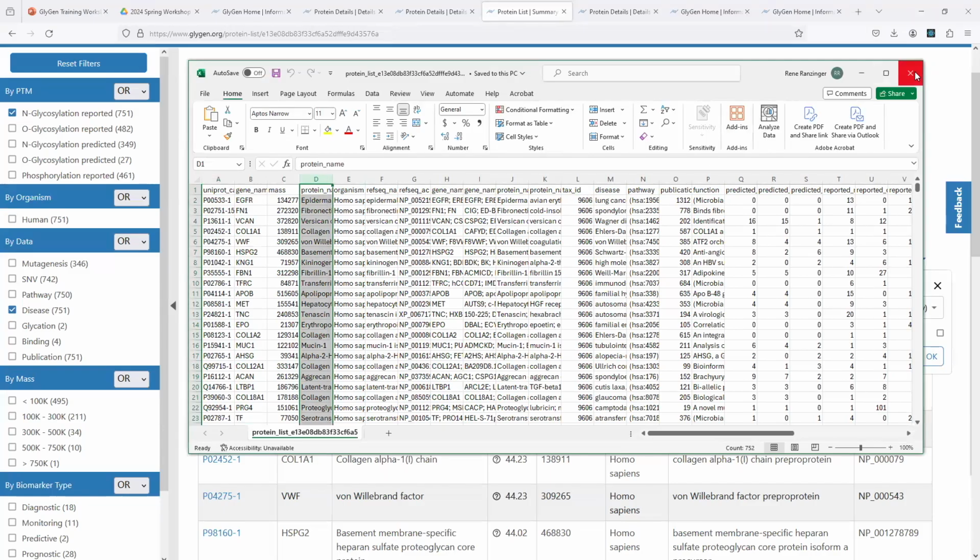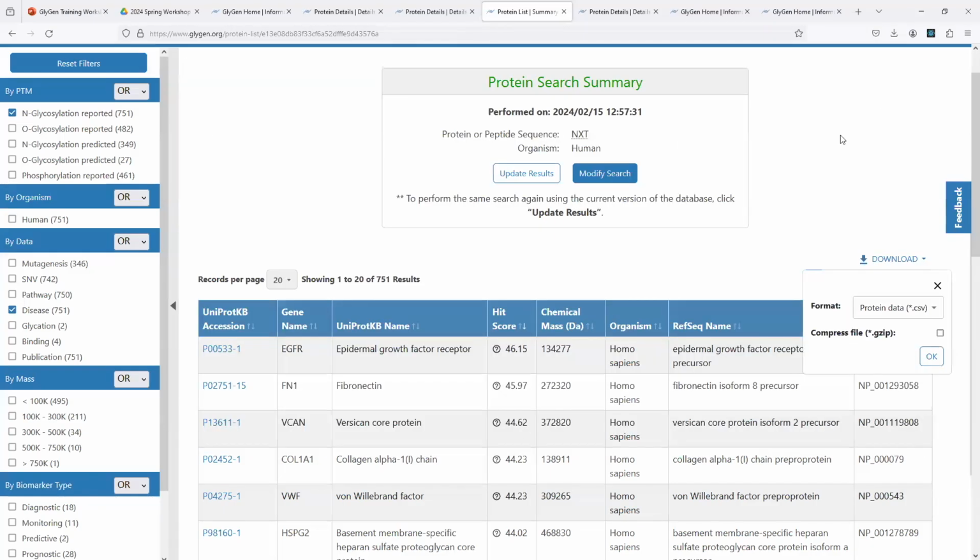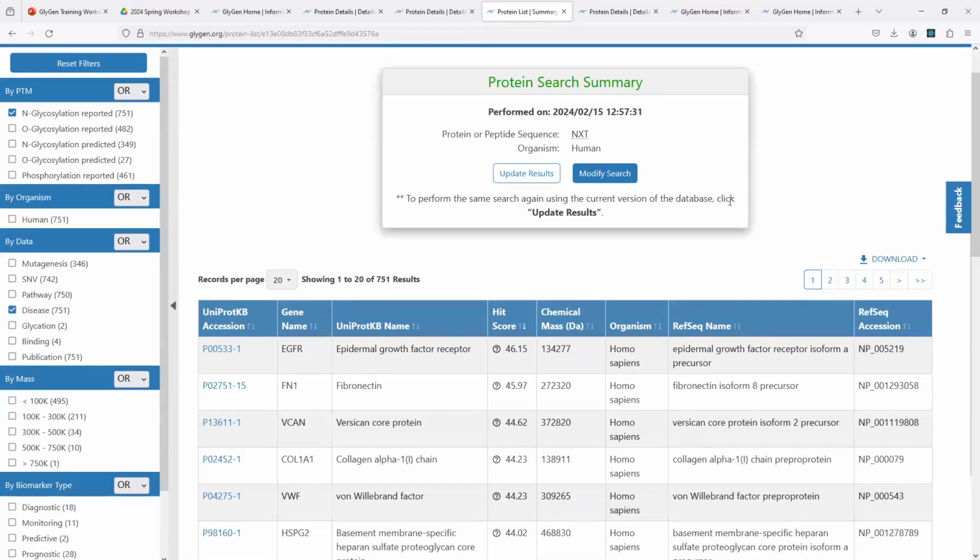One of the things that we are planning in year 3, which is the coming year, is to allow users to customize that table and remove columns and add columns. And then that will also affect the download feature. But that's on our list for the next year, essentially. Okay. And we talked about the modify button already.